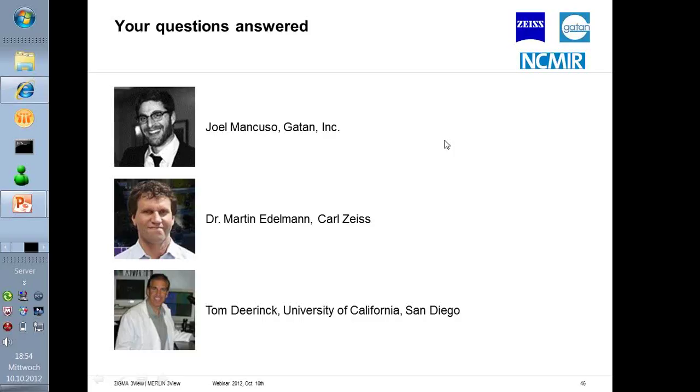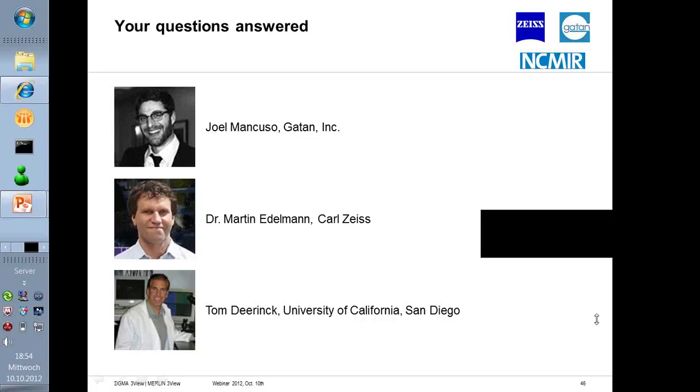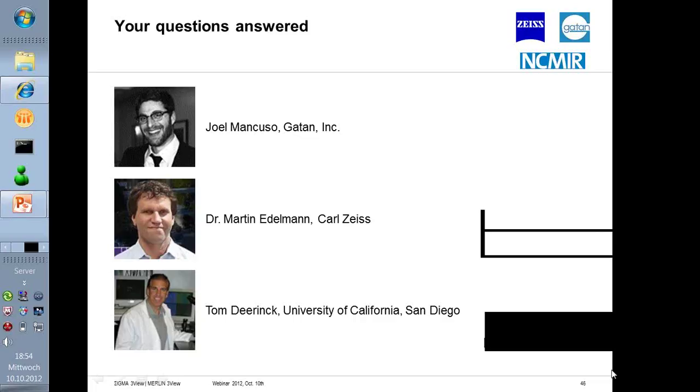Now, if you can use the techniques for conventional TEM, then those same samples can be used for 3D EM. But I think you'll find that it's almost impossible using these traditional techniques to get the labeling in over dozens and dozens of microns with well-preserved material and without having to use these disruptive detergents. So this is why we're directing things towards these new probes, this new way of labeling tissue. But yes, the short answer is, in limited fashion, you can use immunolabeled specimens.